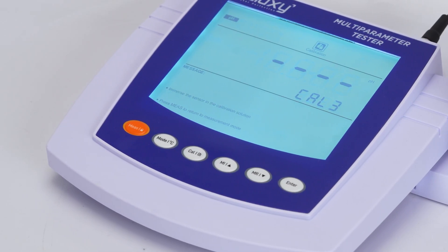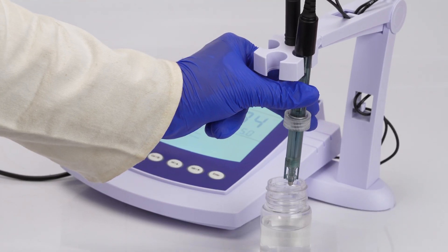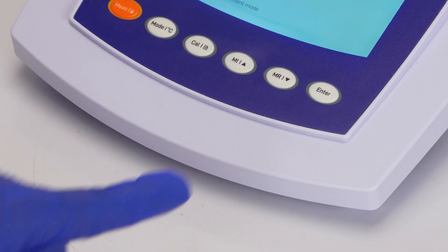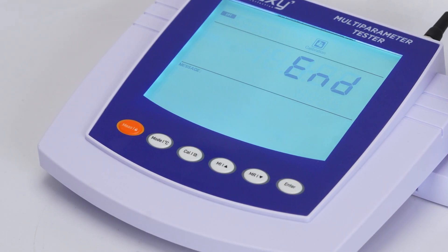For cal three, rinse the electrode and immerse it in the third buffer at pH 10.01, then press enter again. The display will confirm calibration complete.